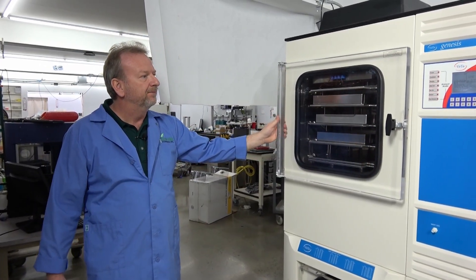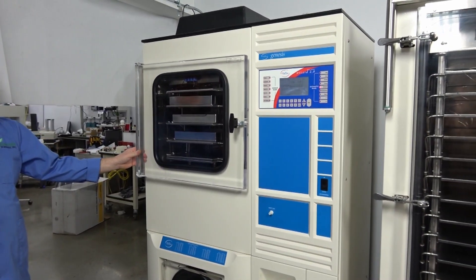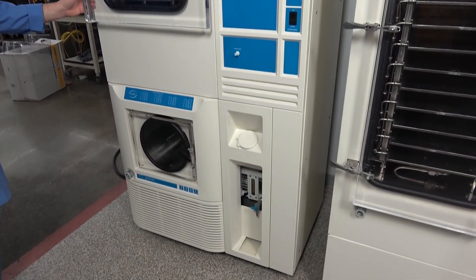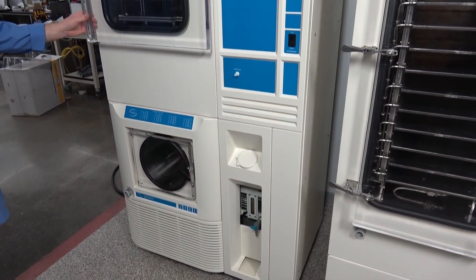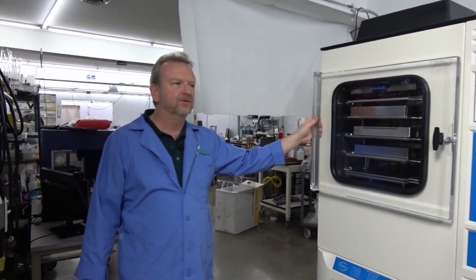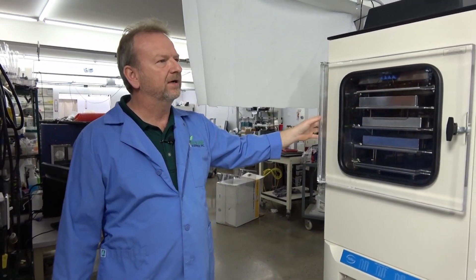There are a few things you perhaps can't do compared to the newest version, but simplicity is what a lot of lab techs really like — just having something simple and straightforward.